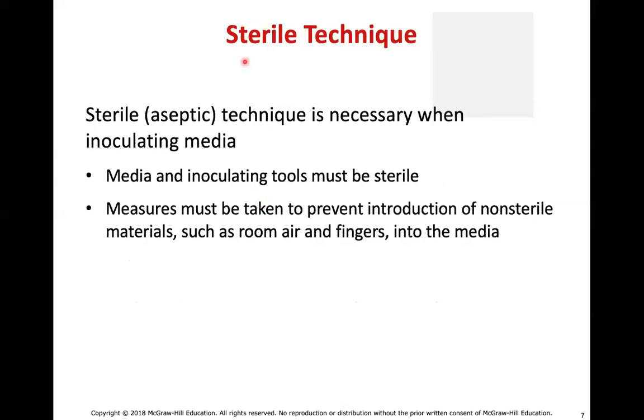Okay, so I mentioned a little bit about sterile technique. Sterile technique is also referred to as aseptic technique. And this is absolutely necessary when inoculating media. Media and inoculating tools must be sterile. Measures must be taken to prevent introduction of non-sterile materials, such as room air and fingers, into the media. Your surfaces do contain microorganisms, and if you were to touch the surface of the media, you would contaminate it.